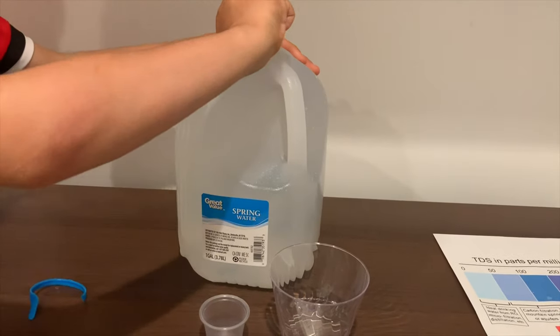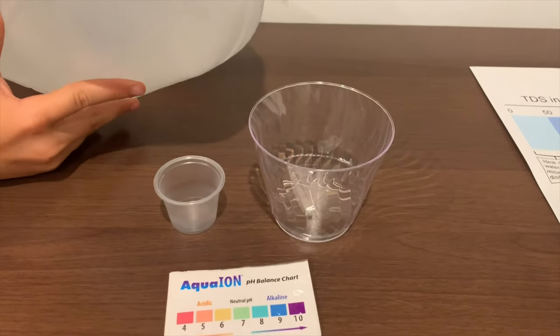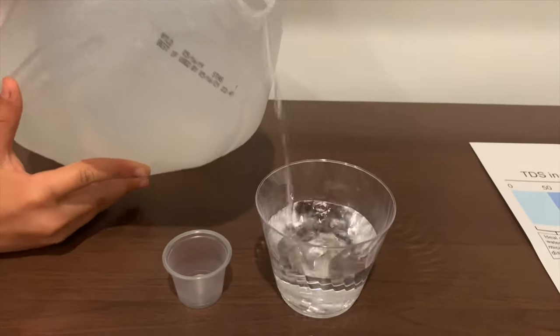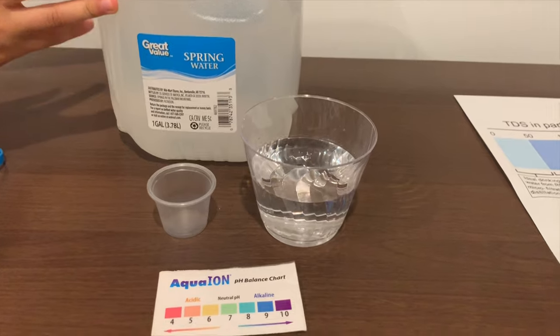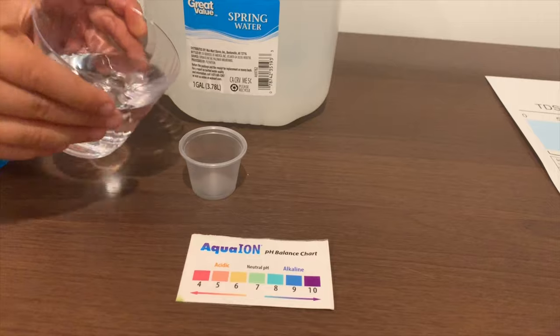Let's pour some water in. Since this bottle is too big to pour in the pH cup, we're going to use the TDS cup to pour in the pH.